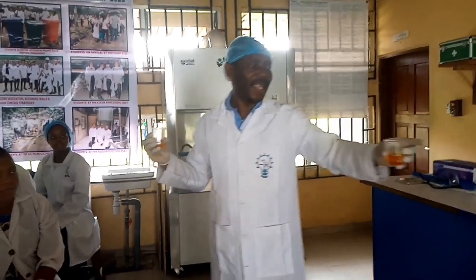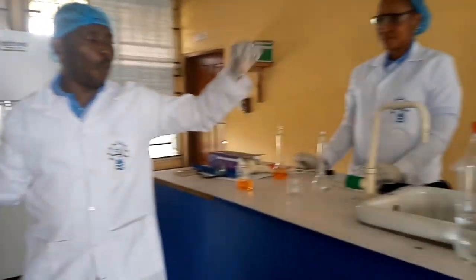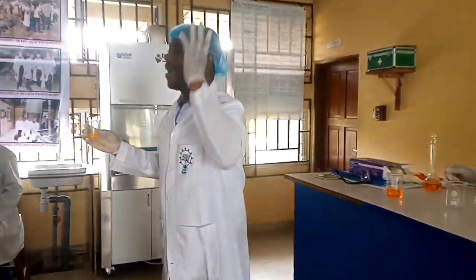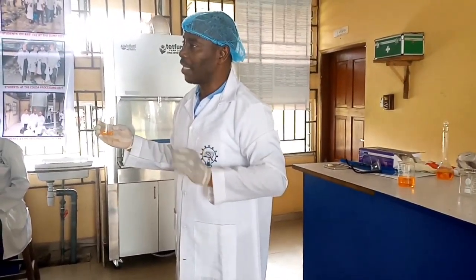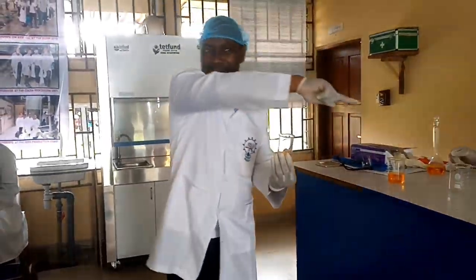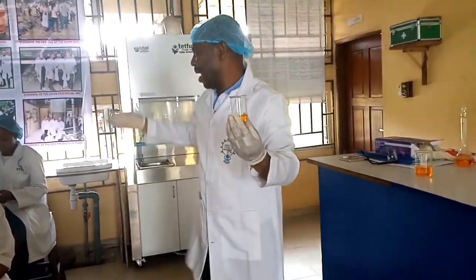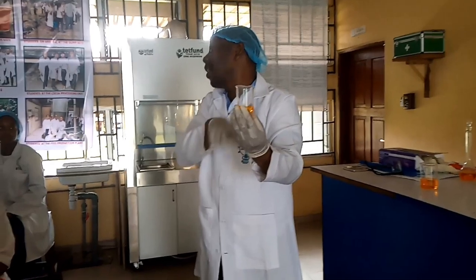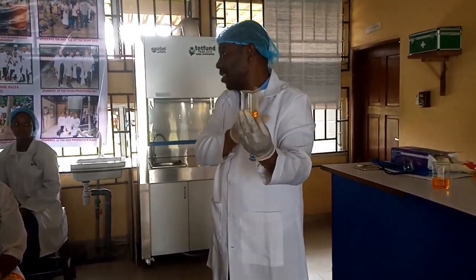The first thing you learned: by putting 5 grams, washing it into this place, making it up to that mark, you have prepared a percentage solution, which is 5. Now, what you have done again, you have taken 5 mil or 10 mil from that original one here, and you are now taking water into this one, the same amount of water. Is it not the same amount?